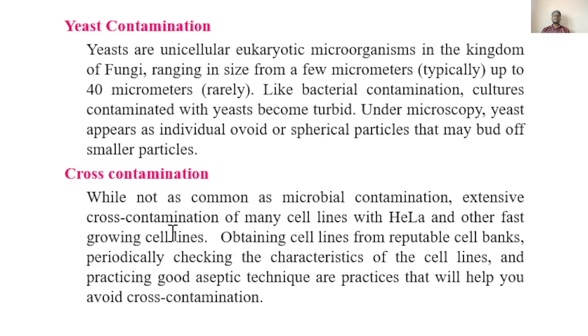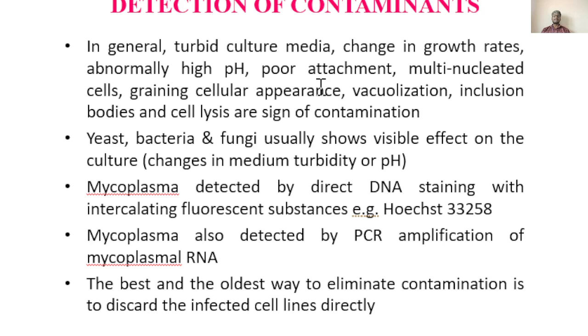Likewise, cross contamination is another important thing. If people use the same incubator with different cell lines being cultured, in a single flask you may notice more than one cell line growing. To avoid this, aseptic conditions are strictly followed, but very often people have to do DNA sequencing to rule out cross contamination. How to detect contamination?